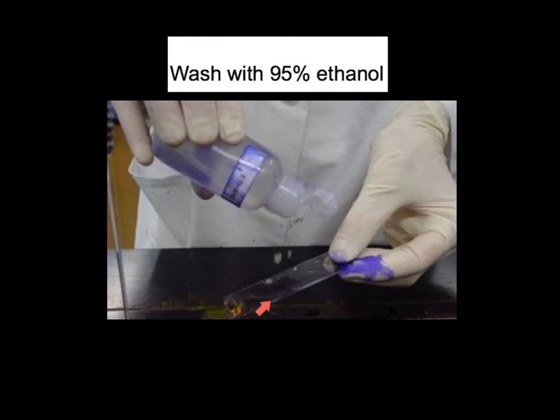Holding our slide at an angle, we will add our ethanol, and we add our ethanol for roughly 10 seconds. I just say count to 10 slowly. We will add the ethanol up above, and we will let it drain down, and it will drain right into the sink. Once we have completed this, again we will rinse and blot dry our slide.